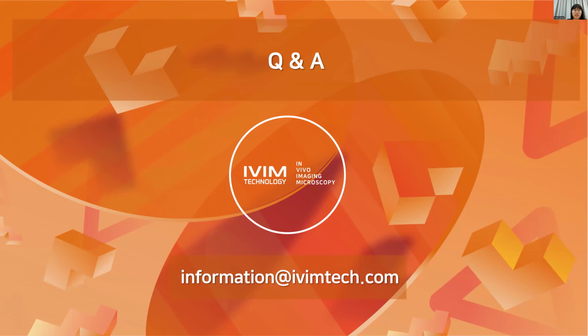And the next question is, will it be possible to also use this microscope for organoids or organotypic slice imaging with a thermostatic chamber? Yes, we have experience in visualizing the organoids in the liver after inducing injury in the liver. So maybe, I don't know the exact type of the organoids you're interested in, but I think we could successfully visualize the organoids in the living body.